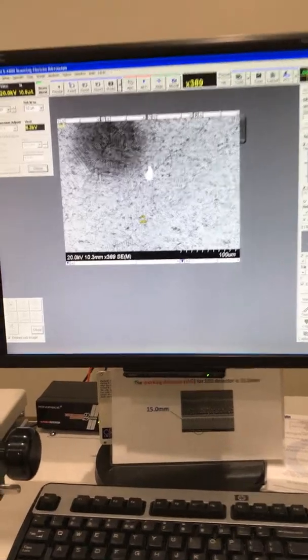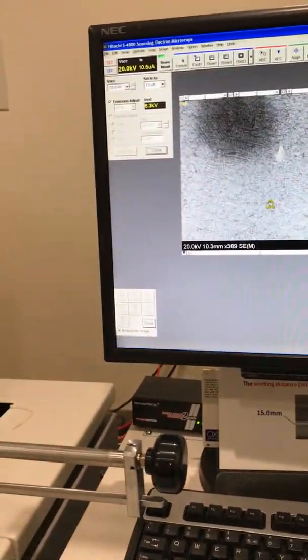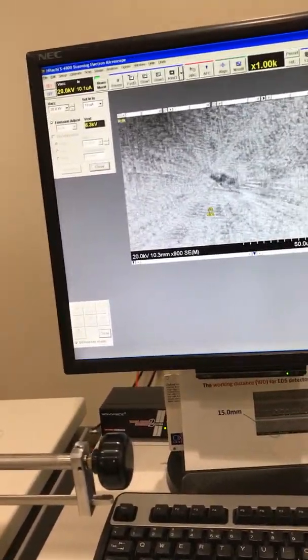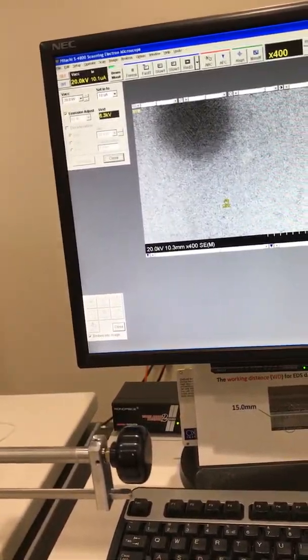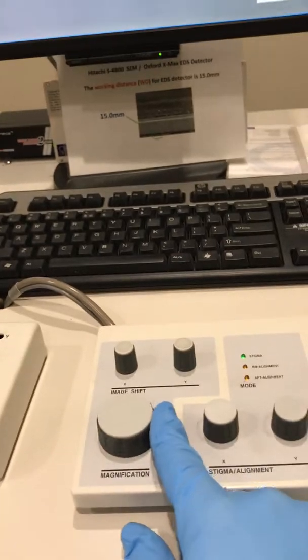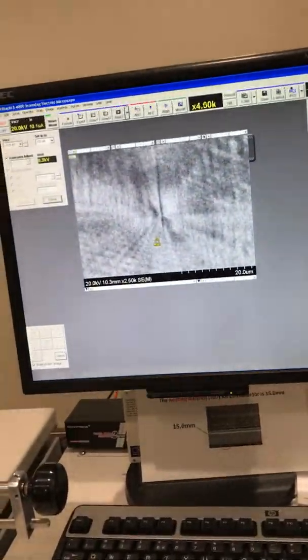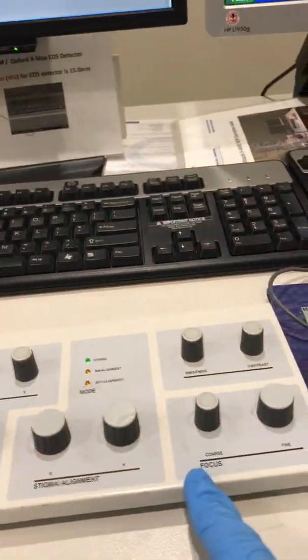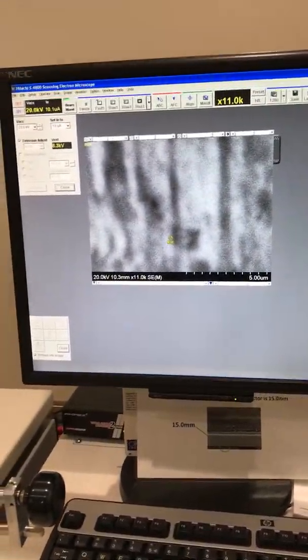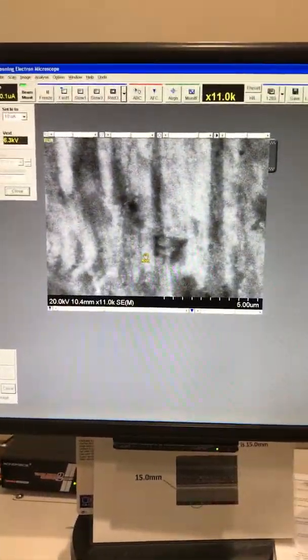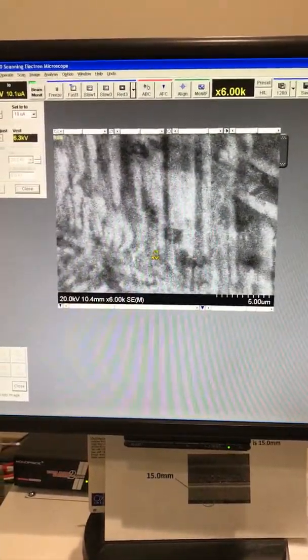Now I'm in focus on my sample and I can go in and try to increase my magnification. Using focus coarse and fine — right now I'm turning the coarse one to find a better focus location. If you are focused at around 10,000x, you can start your alignment.